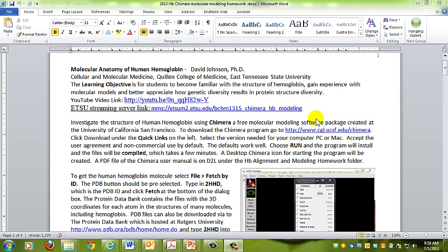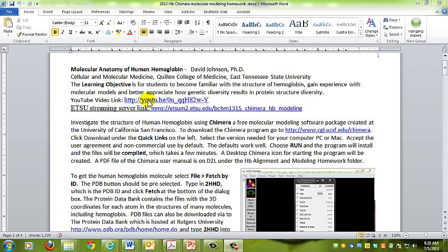This is Dr. David Johnson in Cellular and Molecular Medicine at Quillen College of Medicine. This video is a step-by-step guide on how to do molecular modeling of hemoglobin, to look at the hemoglobin structure and better understand it. I titled it the molecular anatomy of human hemoglobin because it's looking at molecules much like you looked at the body in your human body course when you started medical school.